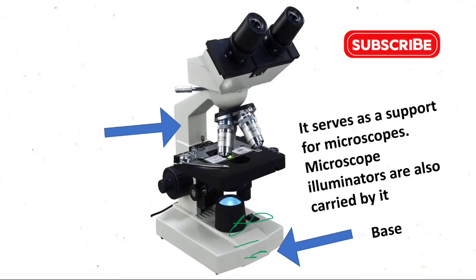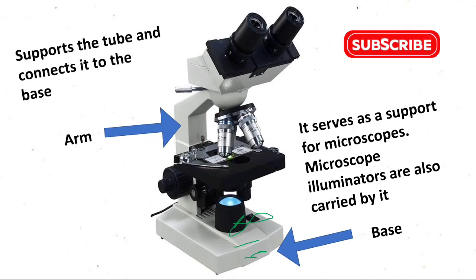Now the next part is the arm. What's the function of the arm? It supports the tube and connects it to the base. So you can also use the arm to lift the microscope.